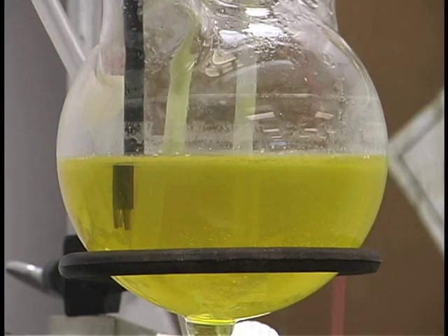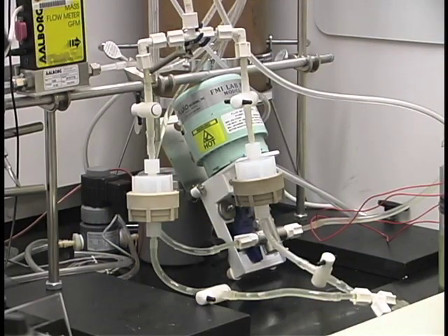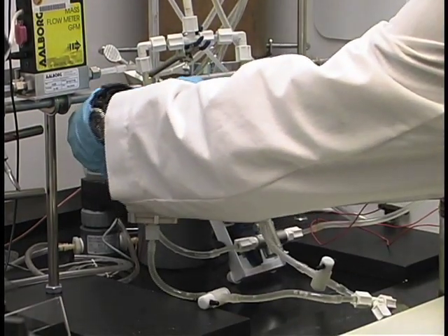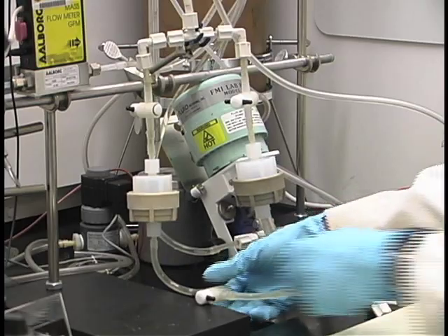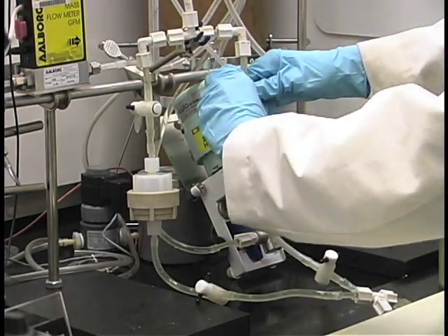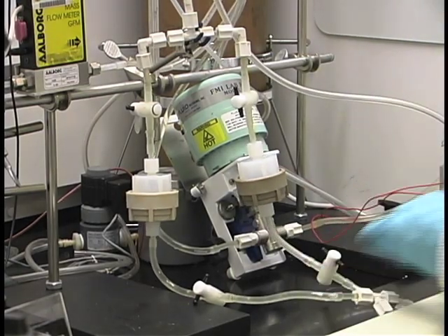This is how the scrubber vessel appears in the steady state. To collect the sulfur precipitate, a dual inline filter arrangement has been installed between the scrubber vessel and the main circulating pump feeding the photoreactor. Stopcocks above and below the filters can be opened or closed so as to direct the scrubber effluent through either or both of the filters.